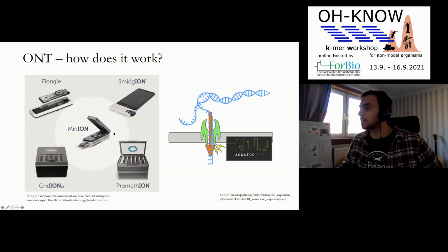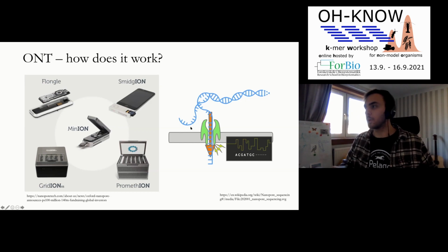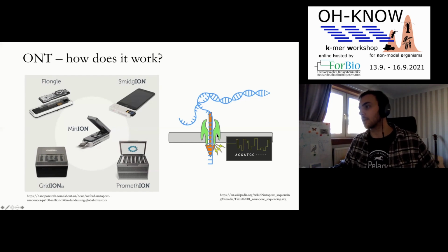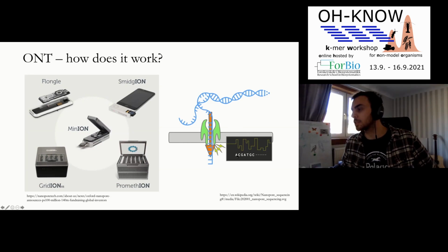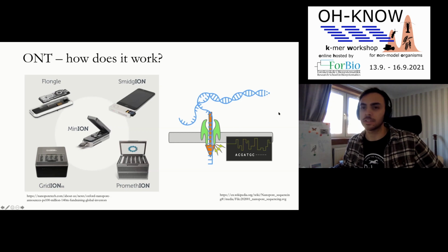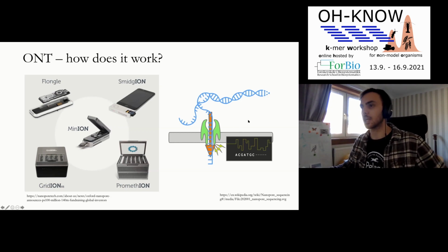The way Nanopore works is slightly different to the others. It's not sequencing by synthesis, but what you do is you take your DNA, you kind of rip the two strands apart, and you pull one of them through this modified, I think it's a bacterial cell wall kind of pore membrane. What the machine actually does is it measures the voltage across this membrane. Each nucleotide, because of its different chemistry, will change the voltage slightly differently, as you can see in this diagram here. From the voltage running across this pore at any one time, you're able to call the bases. And I believe that this technology also benefits from the circularization, where you can run a molecule through many, many times, which is how you get the improved accuracy of nucleotide calling.